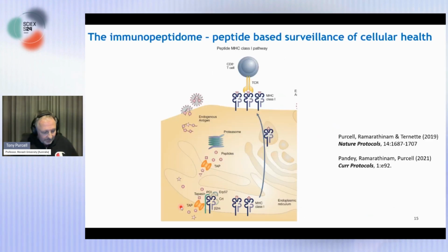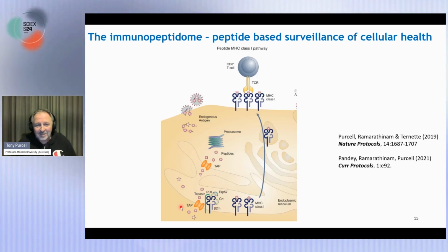Okay, just in the last 5 minutes or so, I wanted to share with you the immunopeptidomics data as advertised in the abstract. So very quickly, for those of you that aren't familiar with immunopeptidomics, this is the study of naturally processed peptide antigens that are derived from typically proteins within the cell, such as viral antigens, for example, tumor antigens, and so forth.